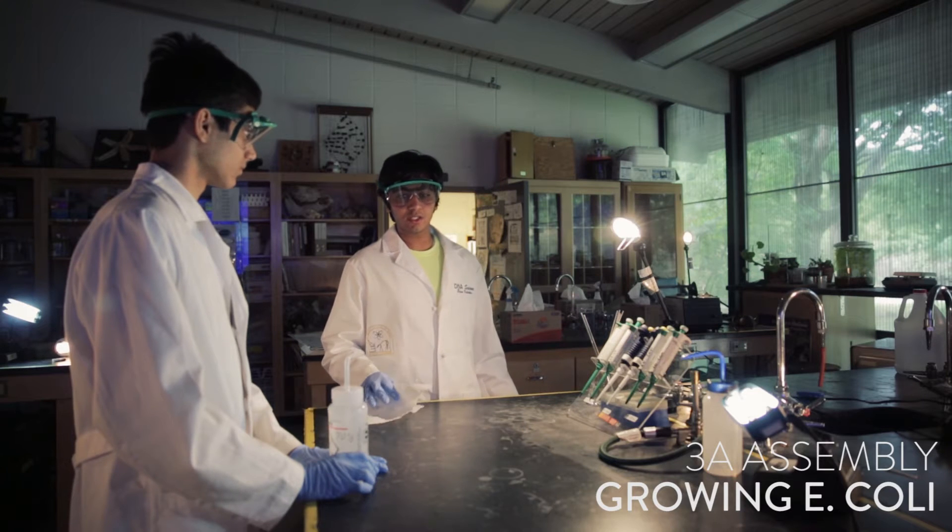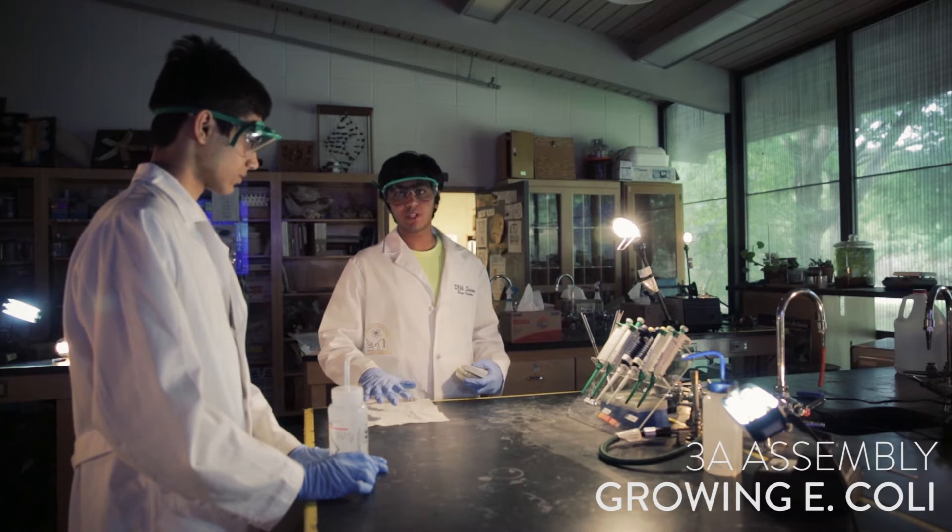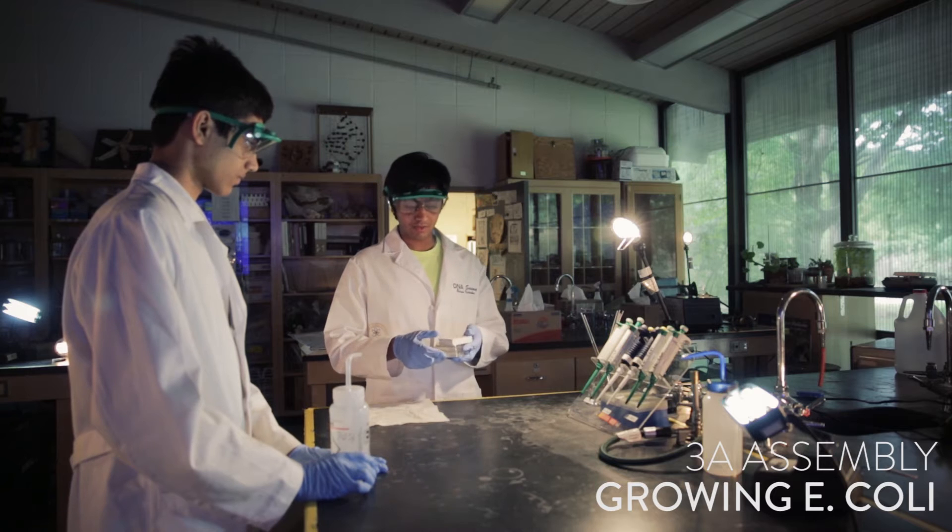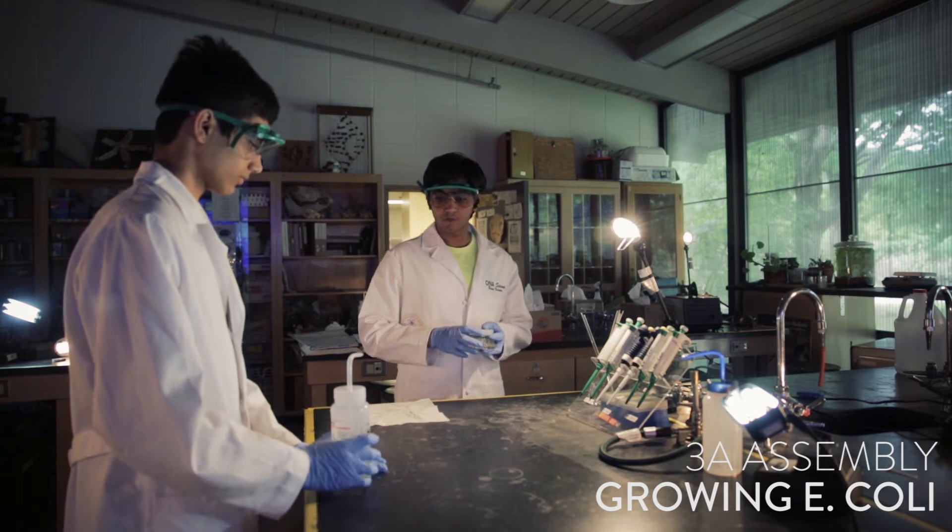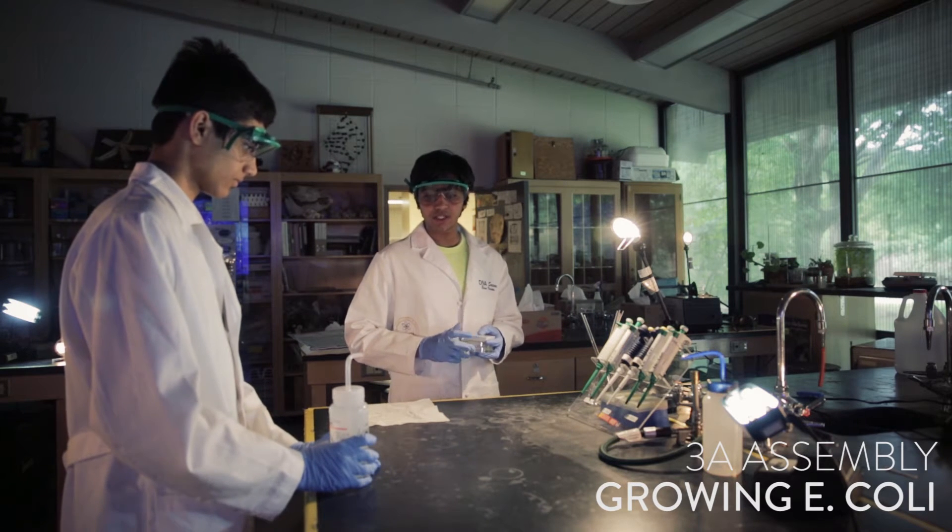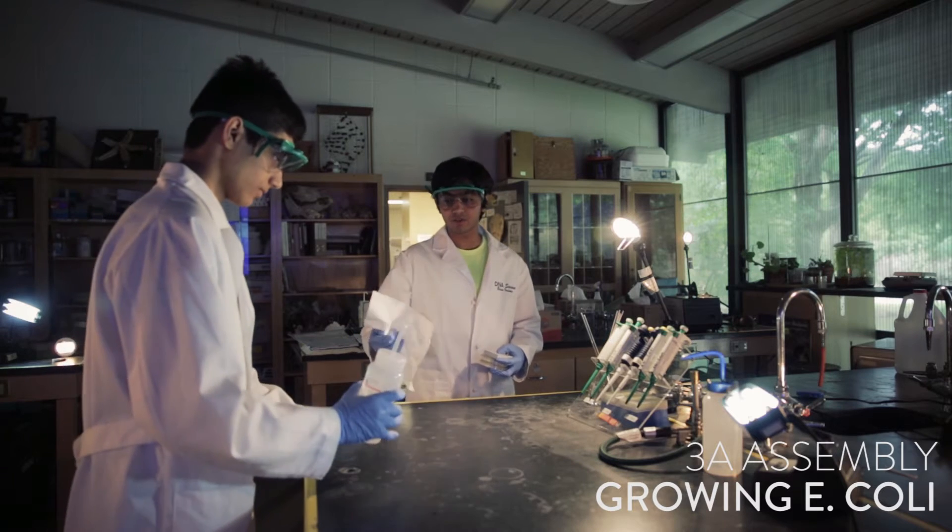So today we're going to do a streak. We're going to streak bacterial plates with bacteria that we have right here. First thing we need to do is sterilize the table with ethanol, 70% ethanol right here.